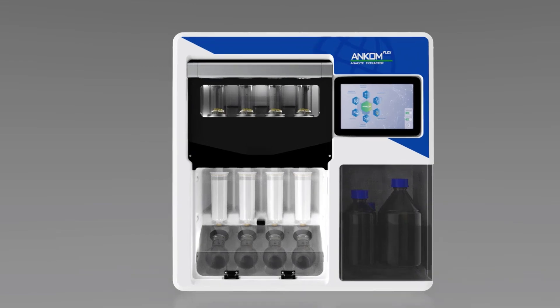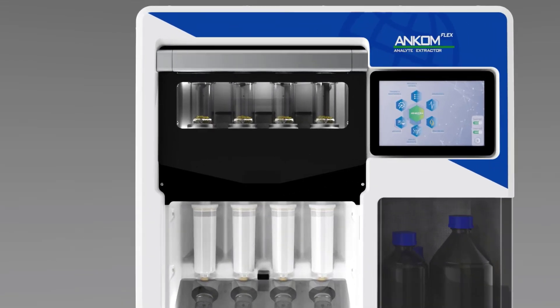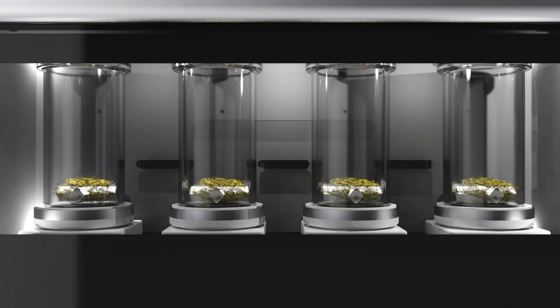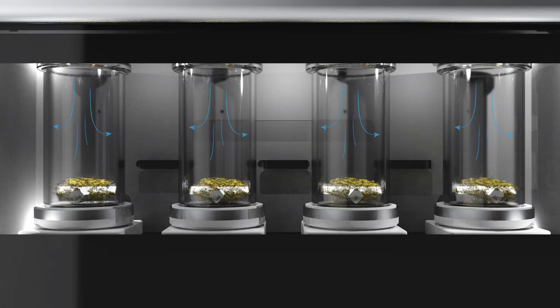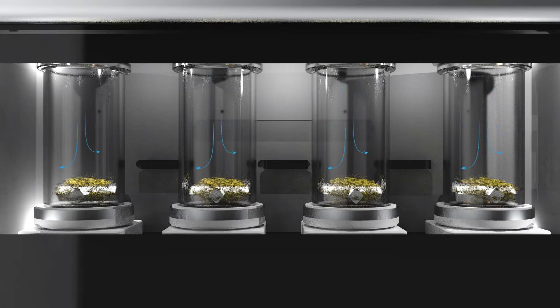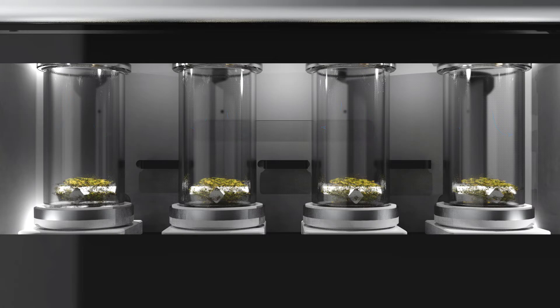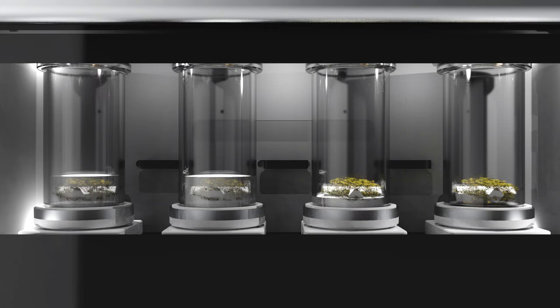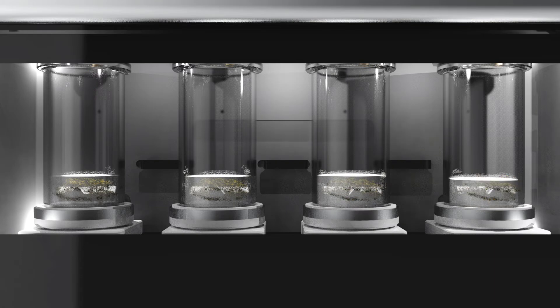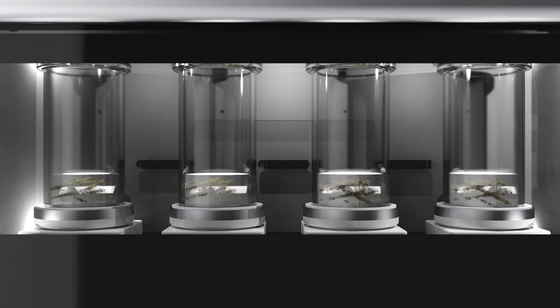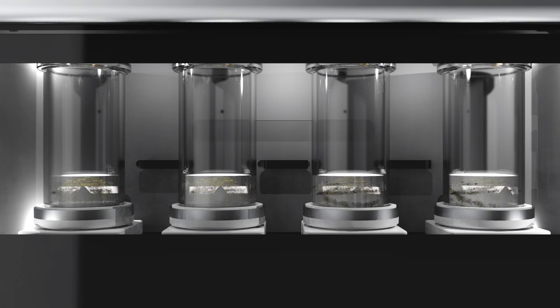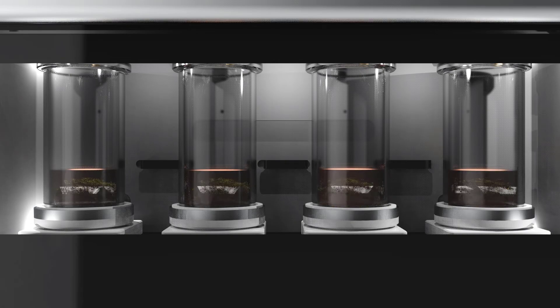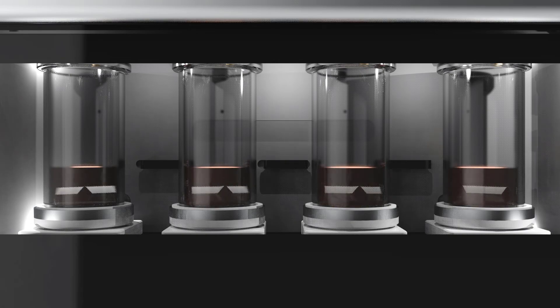To protect sensitive analytes and eliminate contamination, the digestion vessel headspace and SPE columns are purged with nitrogen. Once the system is free of oxygen, reagents are pumped into each vessel while the sample is mixed. Digestion time, temperature, and pressure are monitored and controlled while mixing.